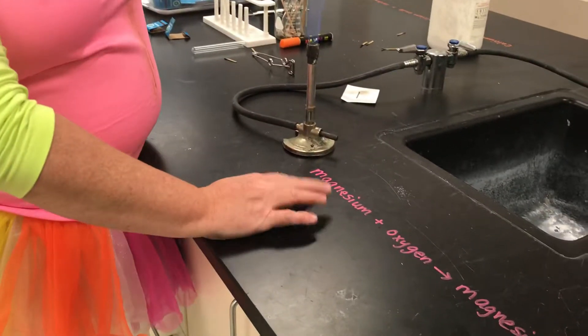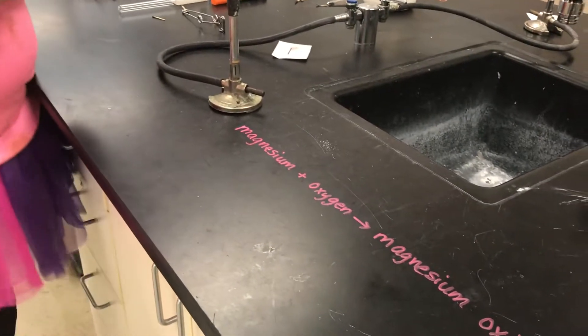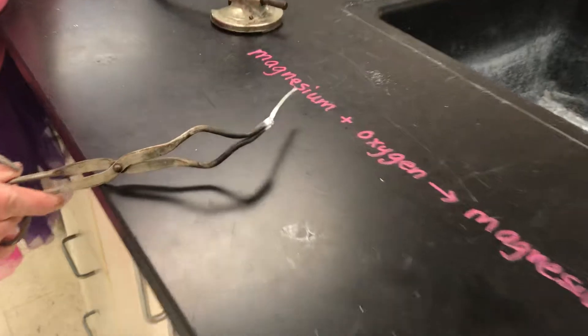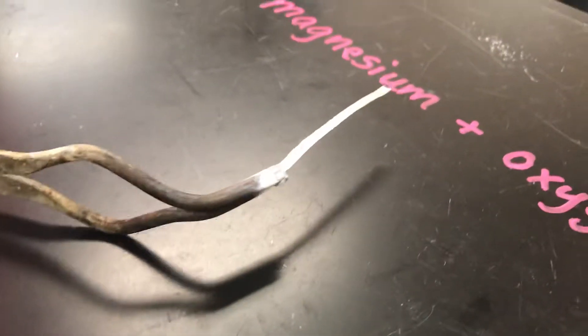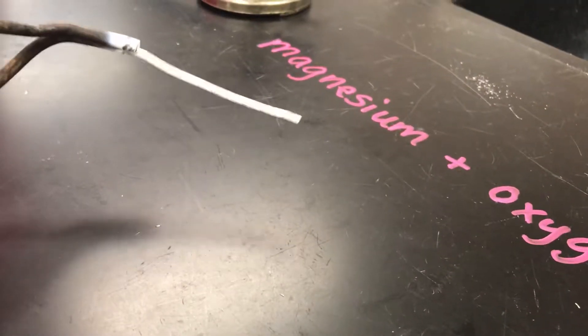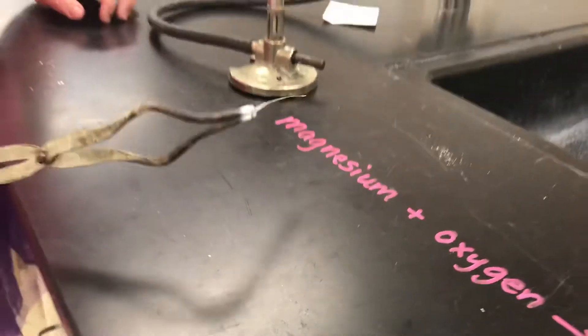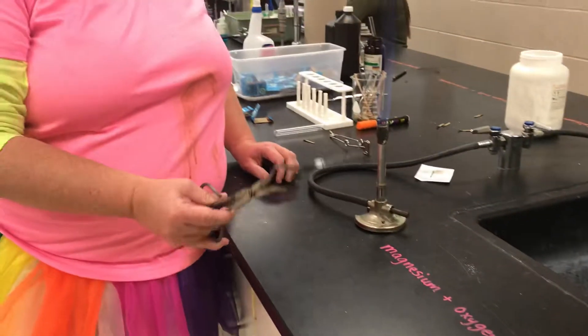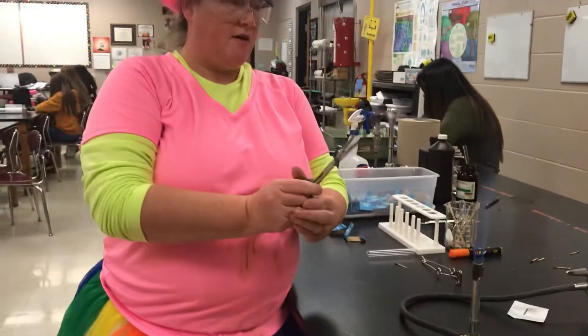In this reaction we're combining magnesium metal with oxygen. This is what the magnesium metal looks like — it's very metallic, shiny, and silver. We're going to provide a little bit of energy to get the reaction started, and it's going to combine with oxygen in the air to make magnesium oxide.